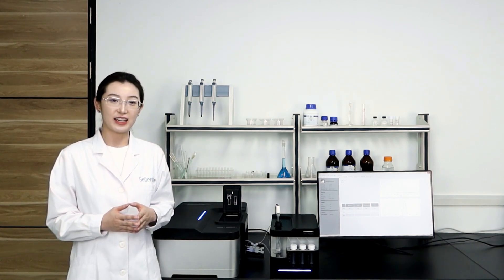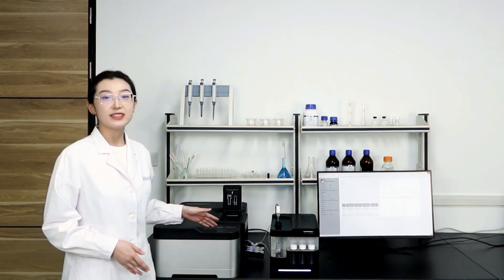We are pleased to introduce you to the latest generation of nanoparticle size and zeta potential analyzer, the Binano 180 Zeta Pro.